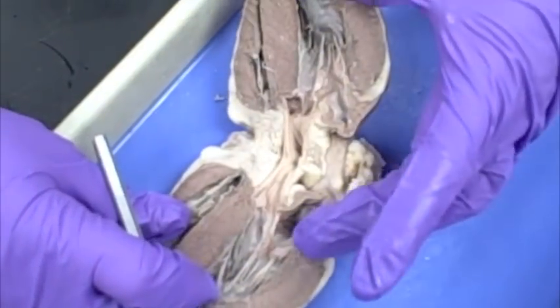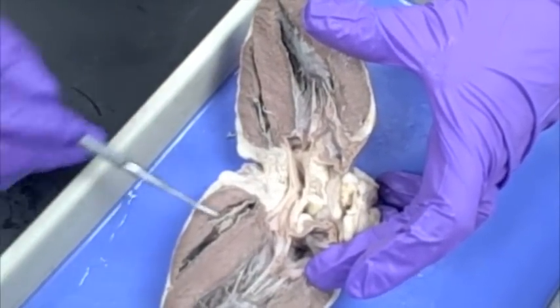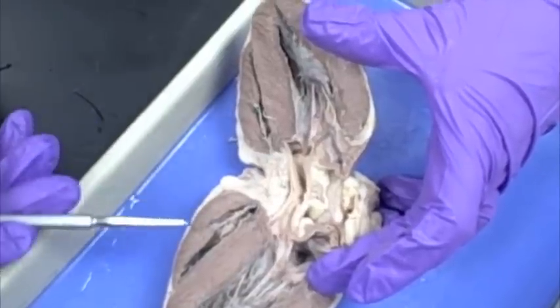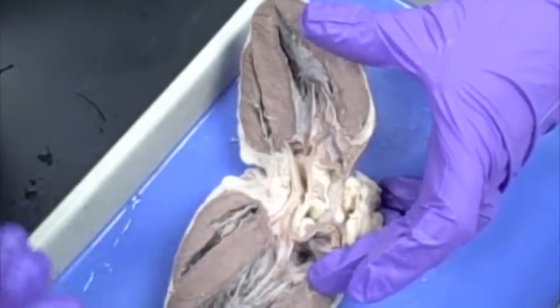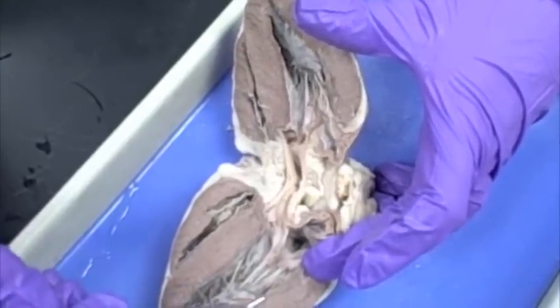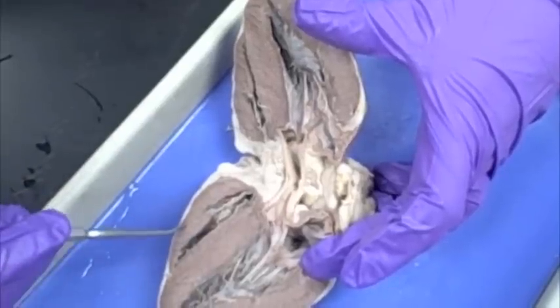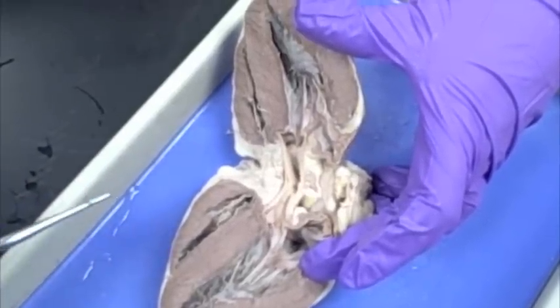This is the heart. We've cut it in half, so when we open it up, we have the right side and the left side. You can tell this is the right side of the heart because the wall is thinner here. It's thicker over here. The left side of the heart has a thicker wall because it has to be stronger to pump the blood to the rest of the body, where the right side only has to pump blood to the lungs.